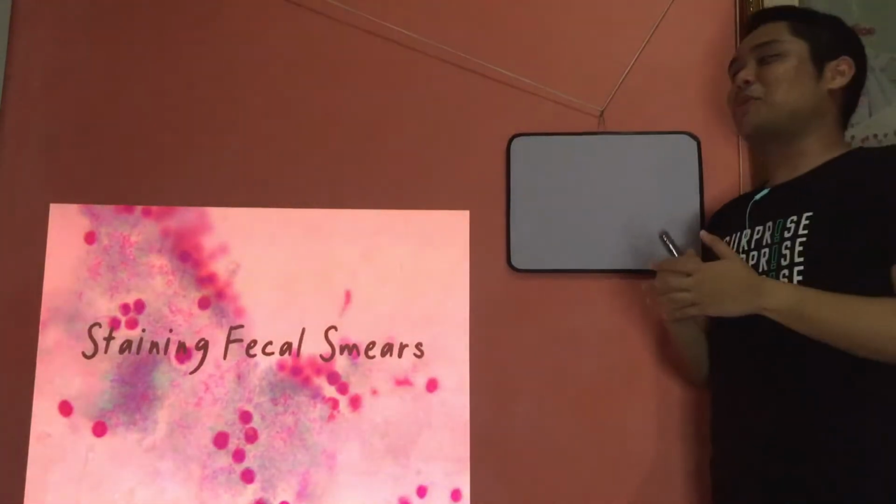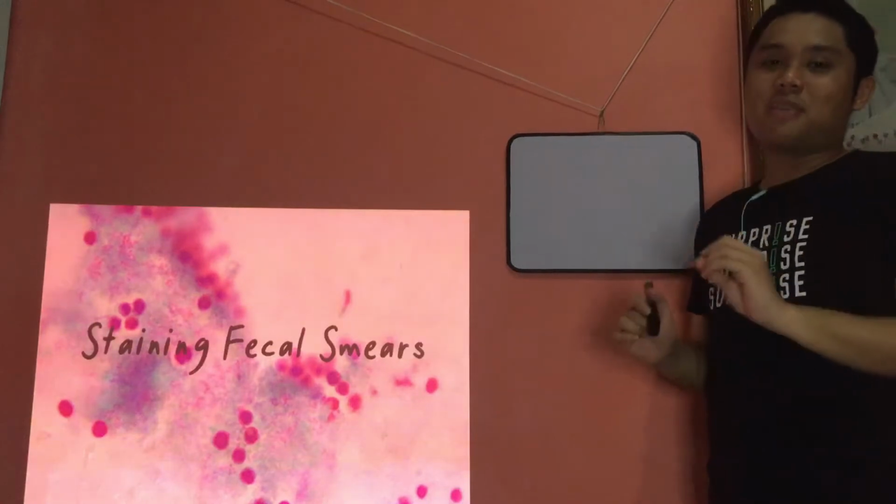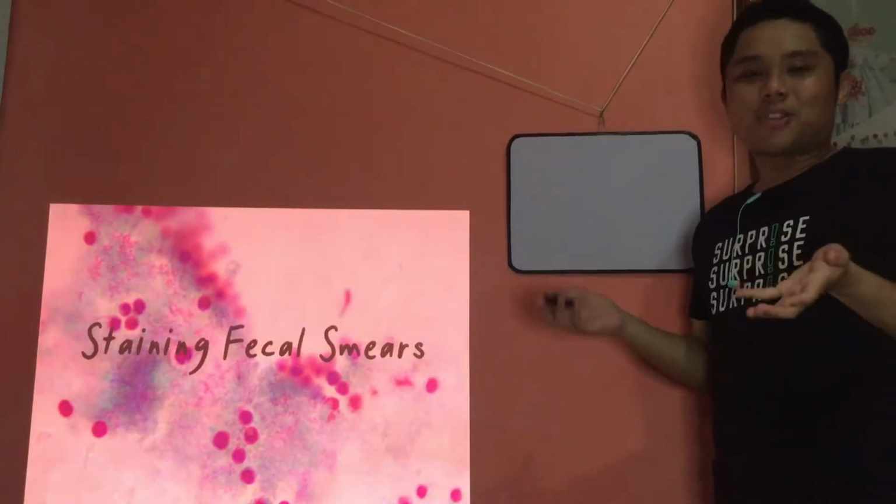For this lecture, what we're going to talk about is staining, okay? Staining fecal smears.